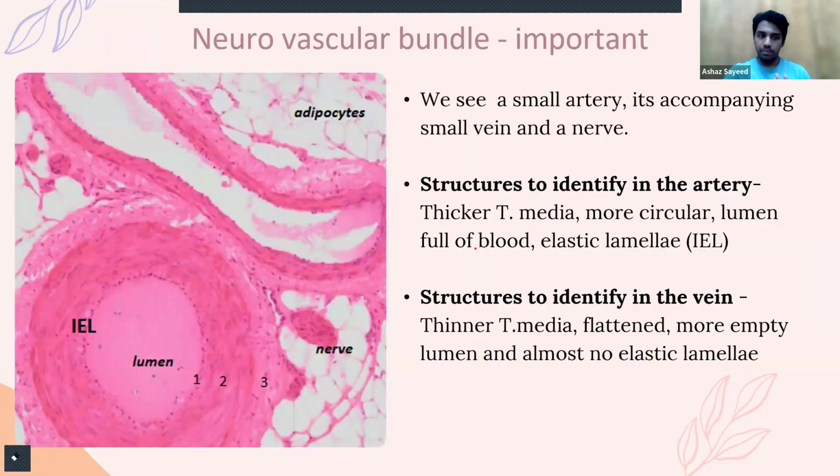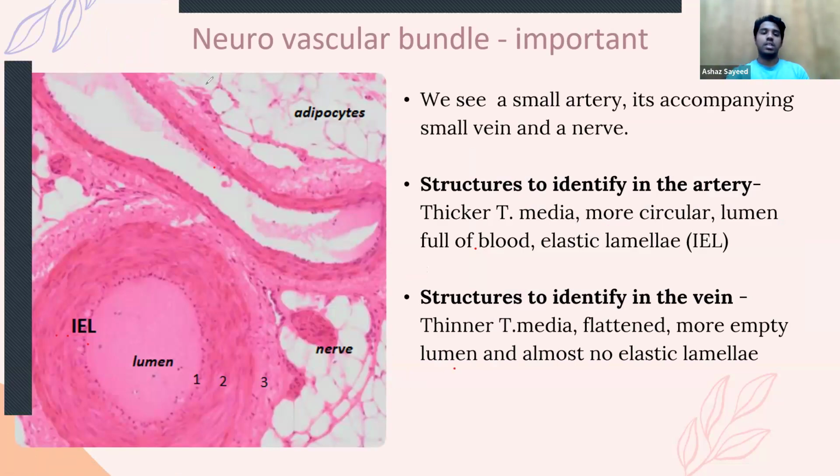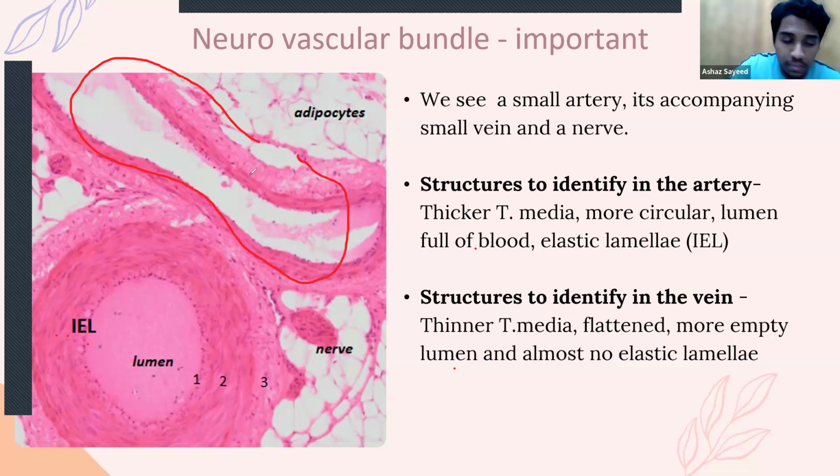That's done. This is a really important image right here. Okay, this was asked previously. So this describes a neurovascular bundle, and this is a vein. This is a small vein. Okay, how can I know it's a vein? Look at the smooth muscle layer. It's pretty thin. Okay, the external layer is much thicker, and the shape, it looks collapsed.